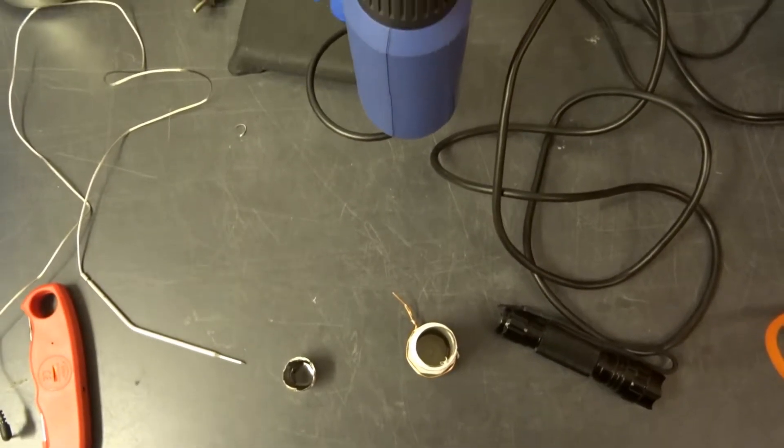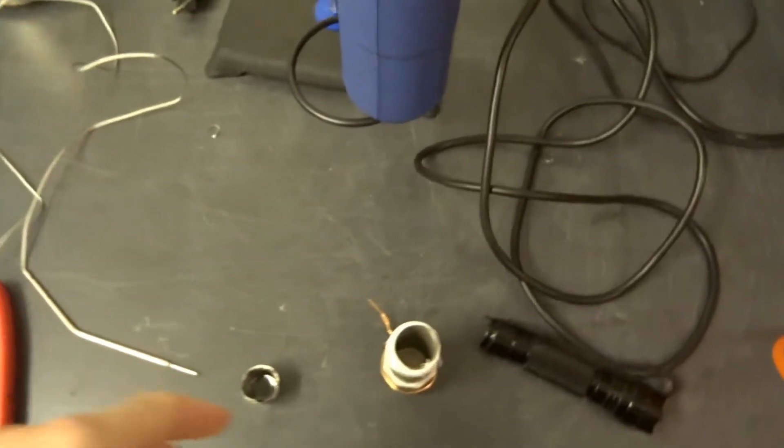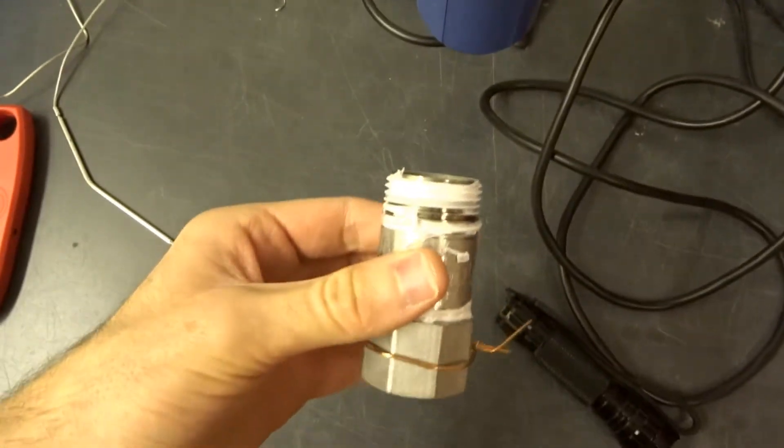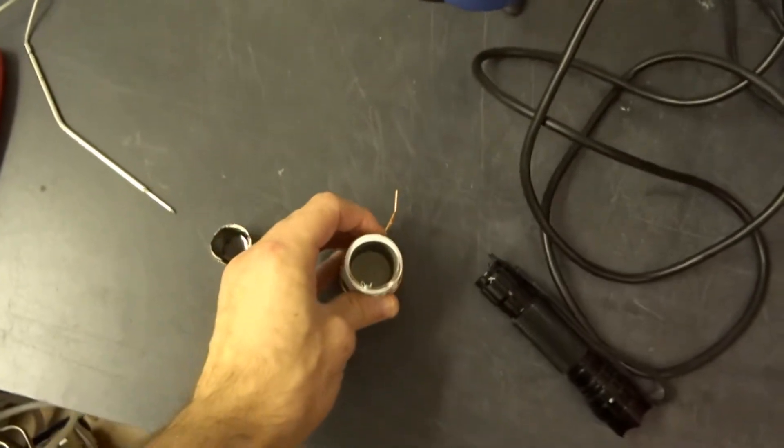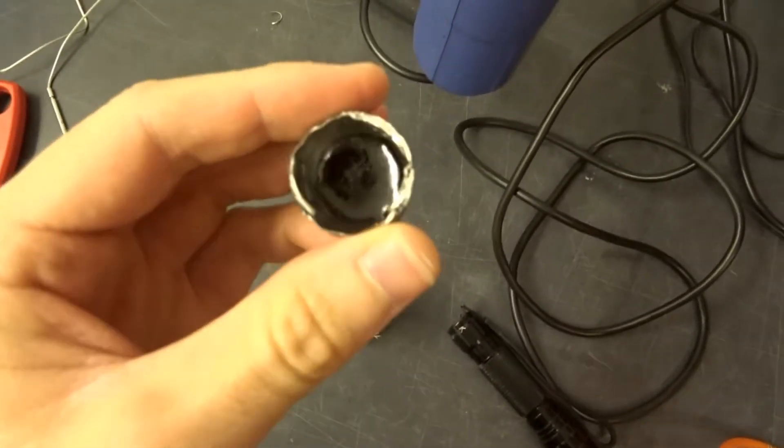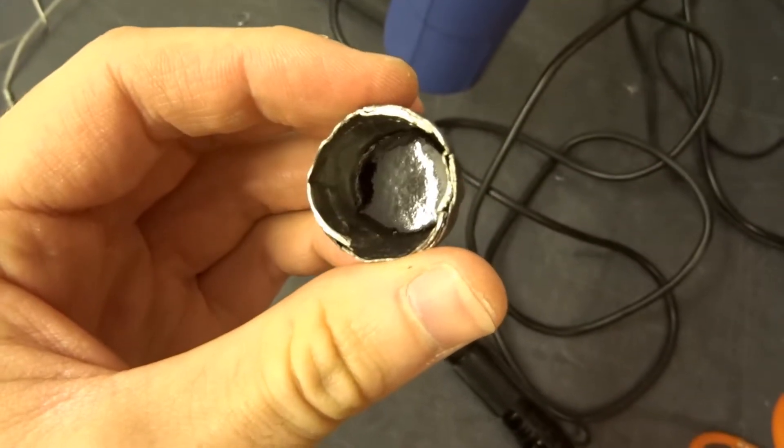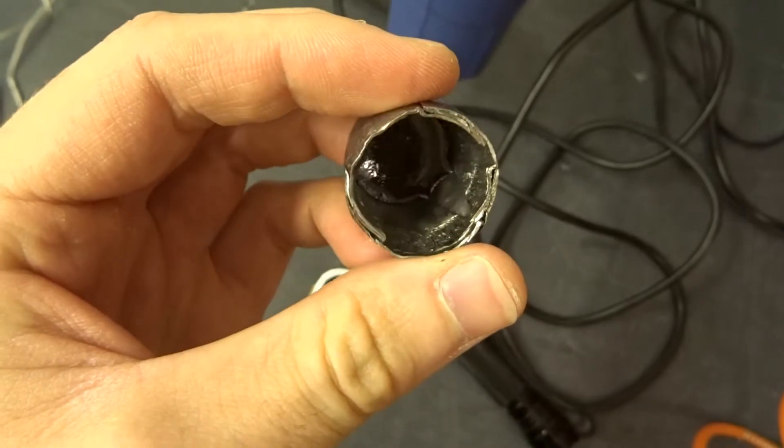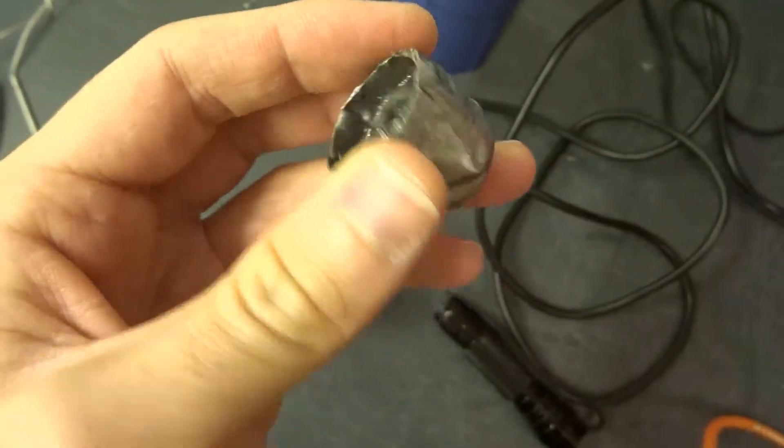So I heated it up a second time. Let everything cool down, depressurized and unloaded the batch and look at that. Not a single bubble. This is some great bakelite.